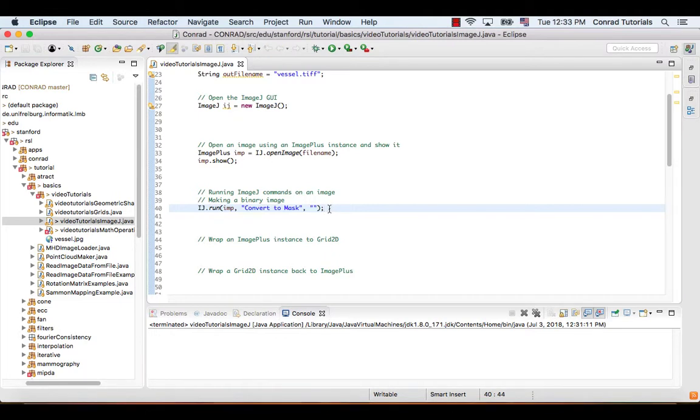In Conrad, we use the grid structure to store the images. So before we can make use of the methods in Conrad, we first need to wrap an ImagePlus instance to a Grid2D instance.